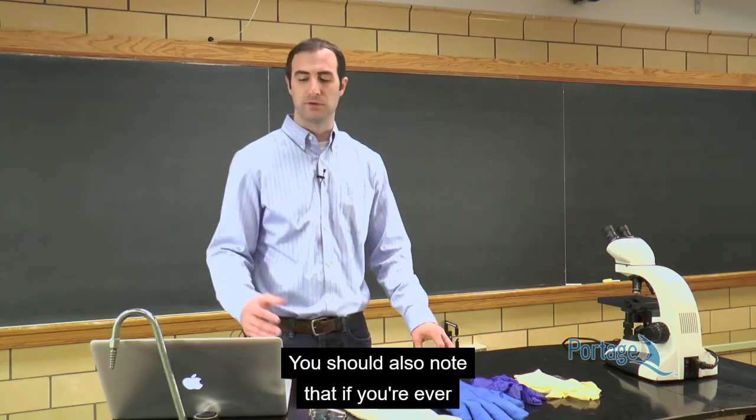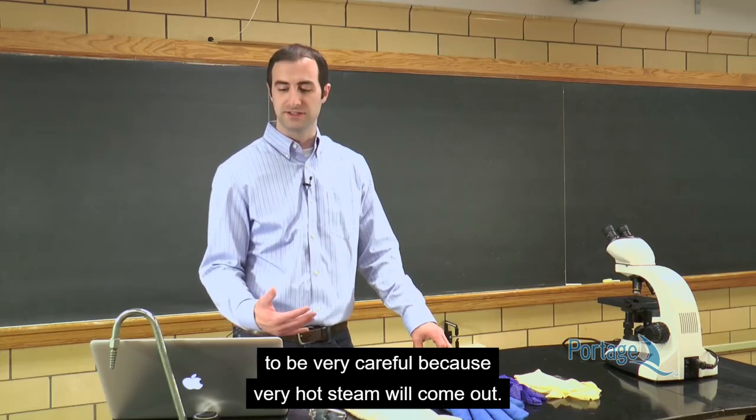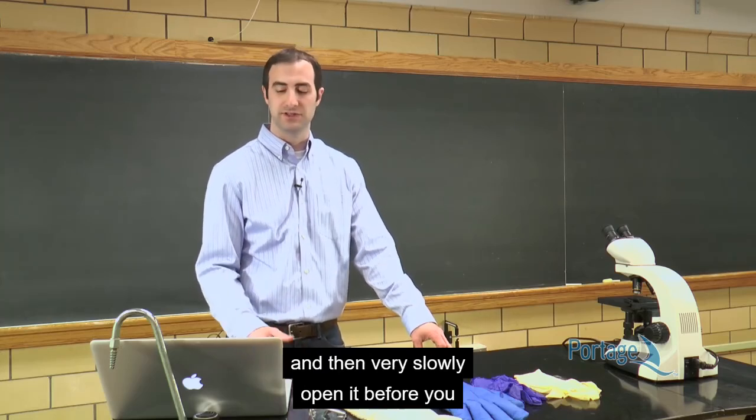You should also note that if you're ever working around an autoclave, if it is finished and you're going to open it, you need to be very careful because very hot steam will come out. So you need to make sure it has depressurized and then very slowly open it before you get your samples out.